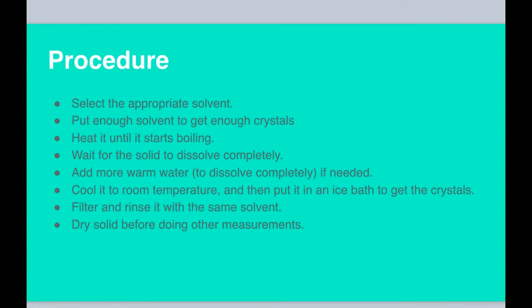Maybe you missed one word: put just enough solvent. Just barely enough to dissolve everything. Yes, okay, continue please.